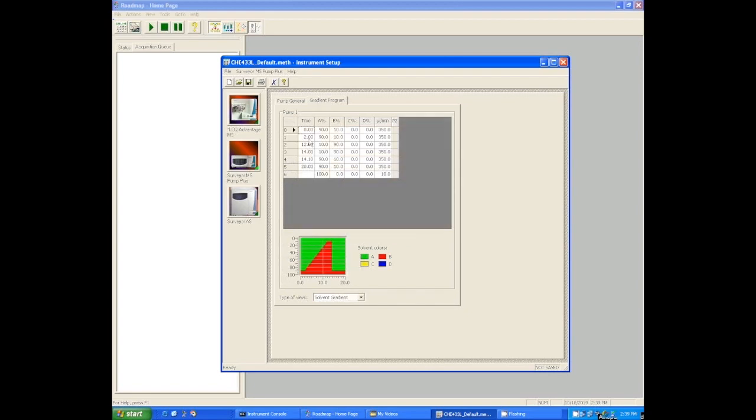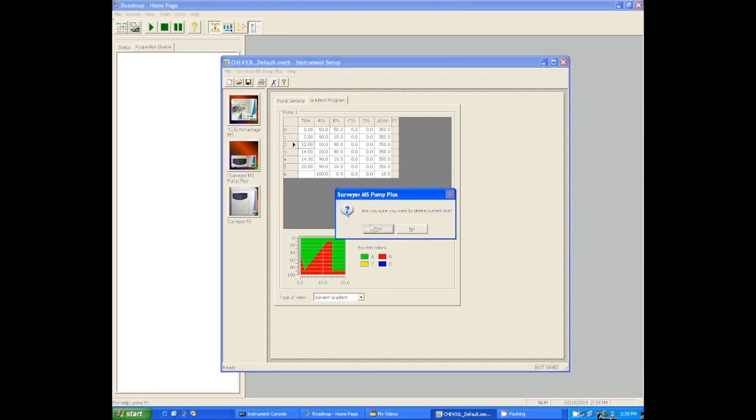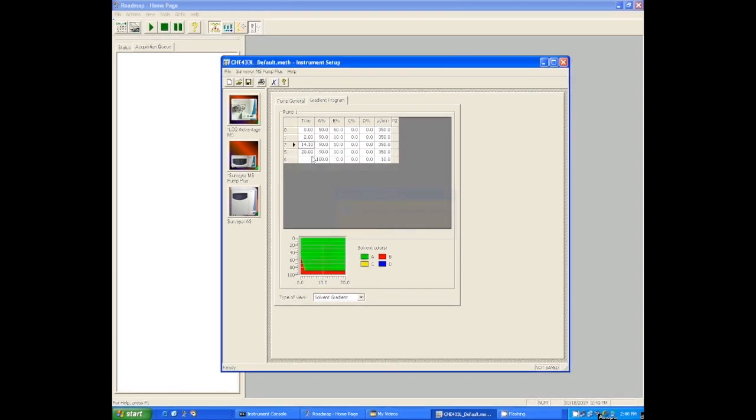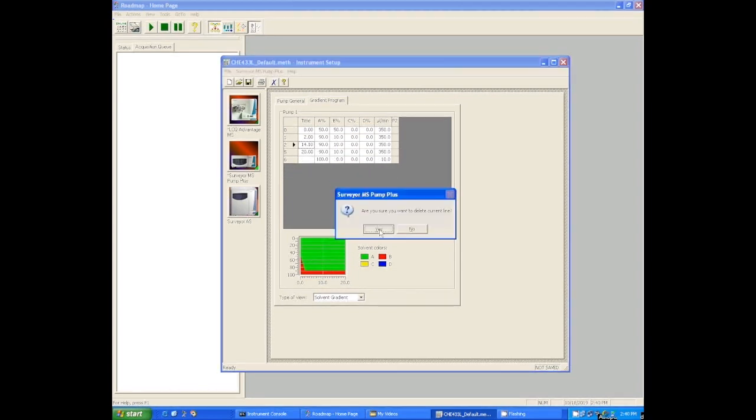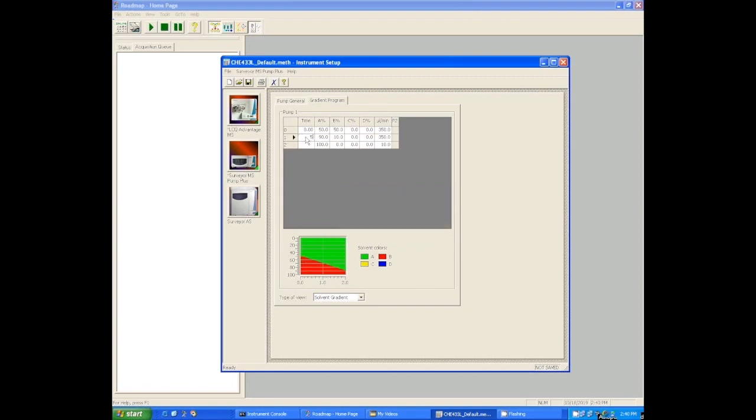Okay, so let's go ahead and switch this up to an isocratic run, a 50-50 AB isocratic run. So we changed to 50-50. Now we don't need all these lines that help us with the ramp, so we're just going to go through and delete all the lines except for two because really an isocratic run is just a five-minute hold at our solvent composition. So we're just holding at 50-50 for five minutes, and that's an isocratic run.